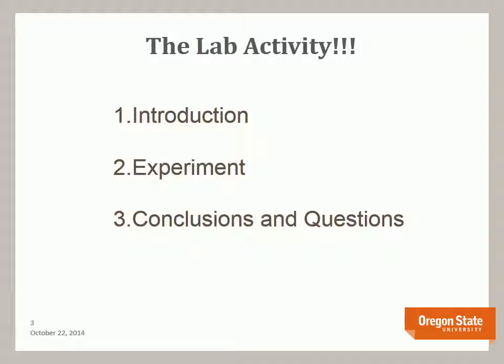Now I will take you through the lab activity itself. There are 3 parts to the lab, as I said before. The introduction, which contains all of the background material that you will need to know for the lab itself. The second is the experiment, where you will be performing the actual tasks and recording data. And the third asks you some questions as well as draw conclusions.